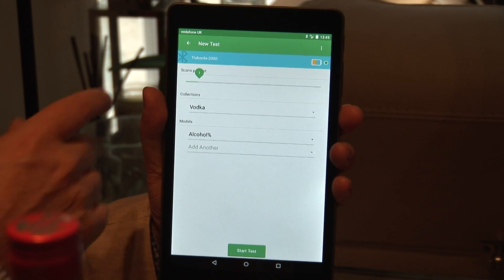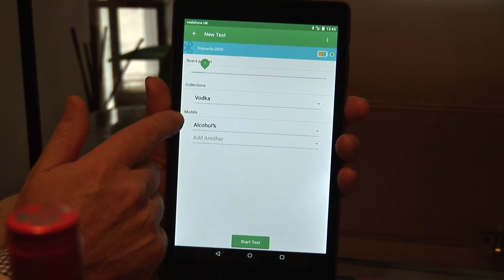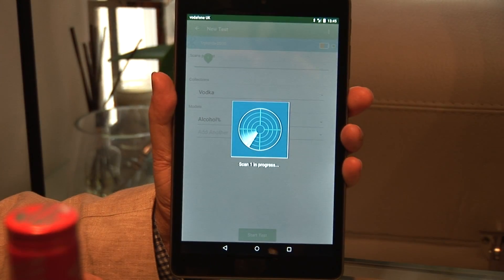We have our tablet running the app. We'll just select one scan and our vodka alcohol model, and press the button to start the test. As you can see, it takes a couple of readings.